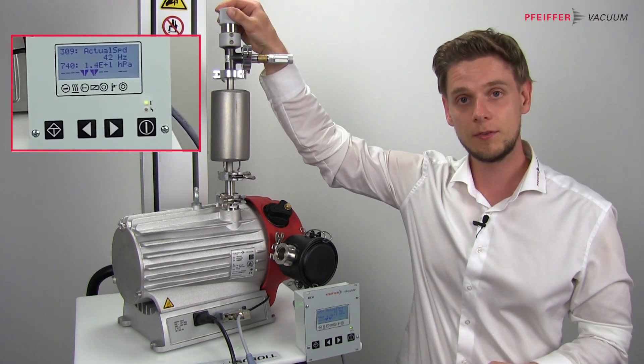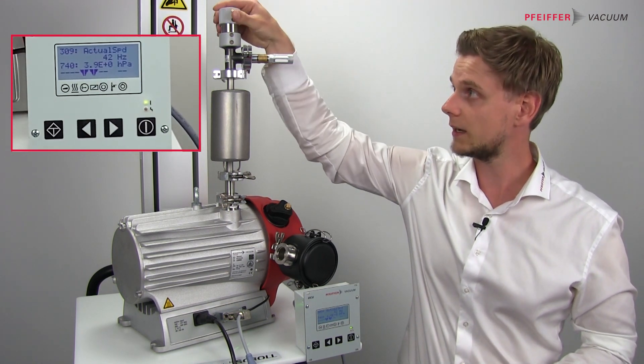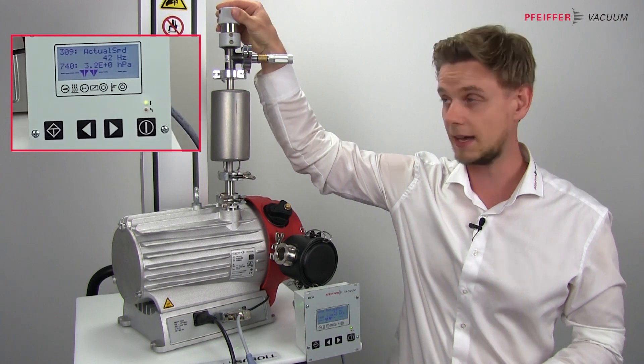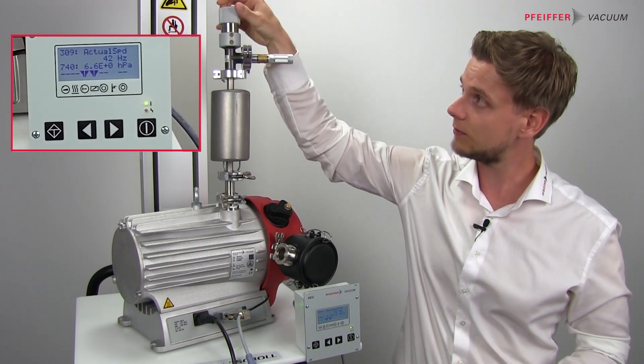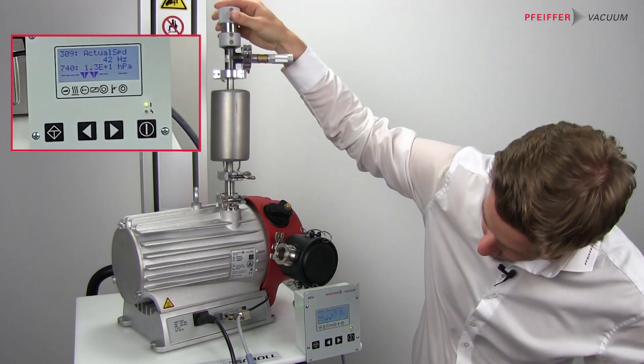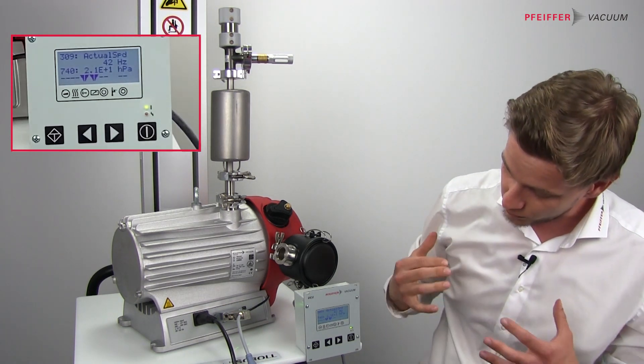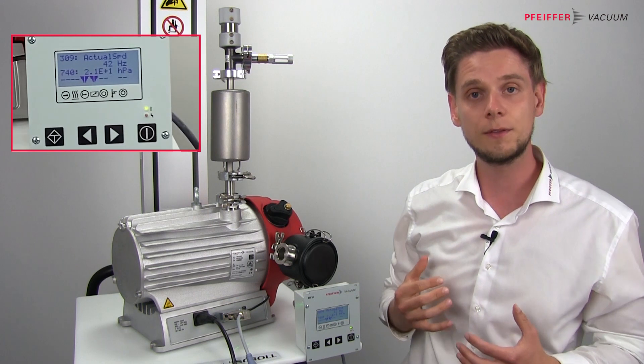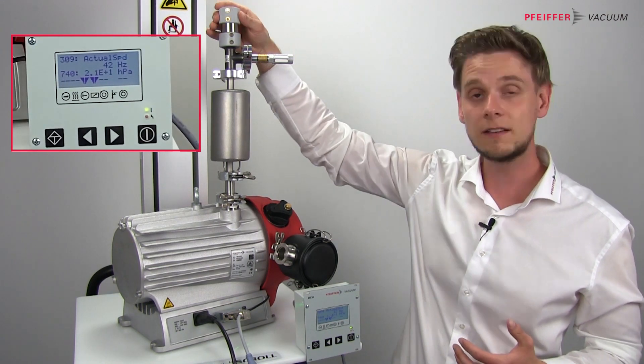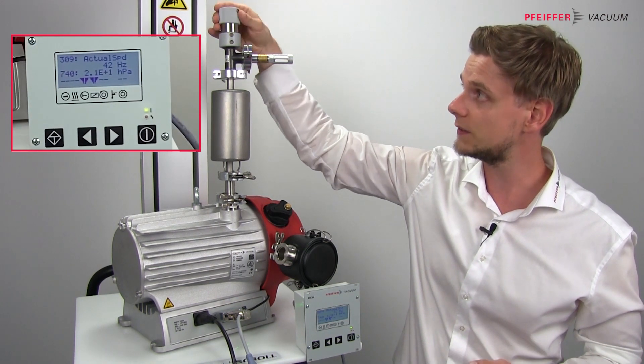Up here I have a fine dosing valve where I can regulate the gas load. If the gas load is very high, the pump switches to full speed and wants to try to get the three millibar. As the gas load is too high, I have to reduce this a little bit.